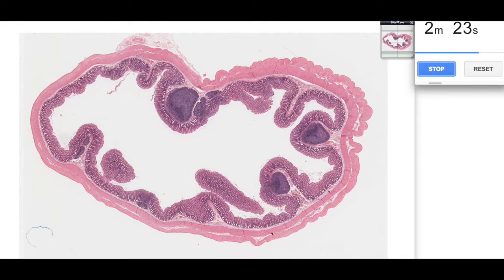The other things that we can note from this magnification are these folds. These are non-permanent folds, a little bit like rugae. So they're folds of both the mucosa and the submucosa, and they're non-permanent so they can expand to accommodate the feces as it makes its way through the large intestine.